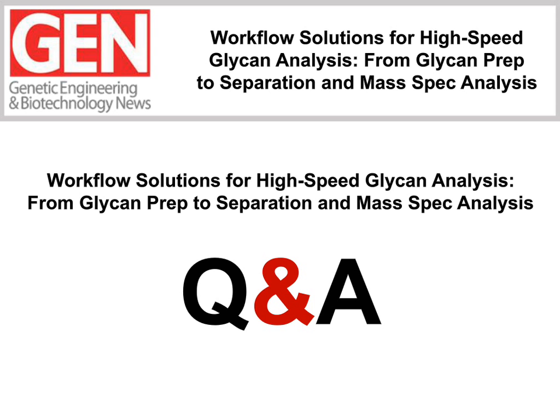Some people prefer that method because they like the high resolution. Modern HILIC with these new columns is nearly as good in terms of resolution. However, some people prefer it because of the ease of use or just being more familiar with HPLC. In terms of MS coupling, you can do CE-MS just as you can do the HILIC LC-MS. However, that's a little bit more complicated, and I think that overall it's easier to couple the HILIC with mass spectrometry than it is with the CE, although some people have had success with the CE-MS coupling.